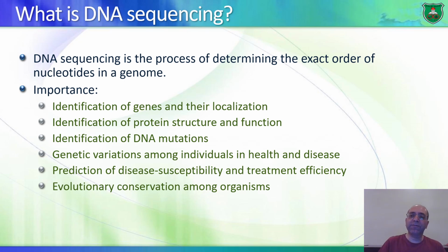So you take it from 5' end to 3' end, and you start reading the DNA sequence going like A, G, C, T, A, T, T, whatever. Okay, all the way to the end.